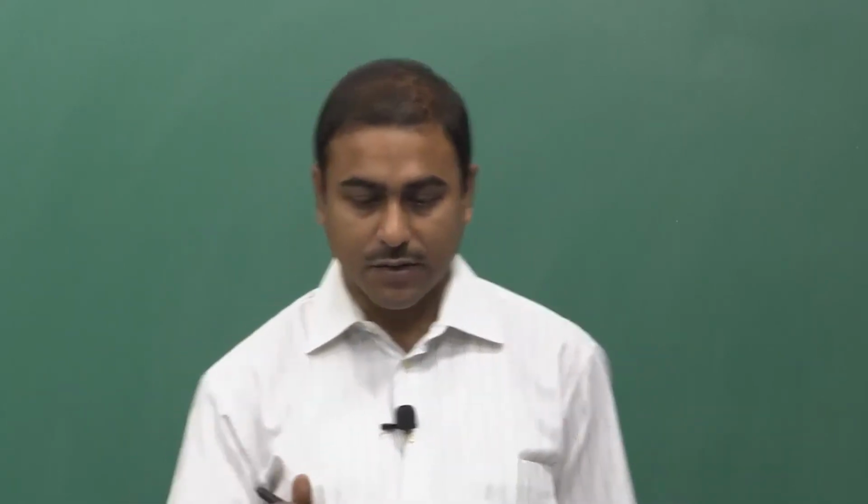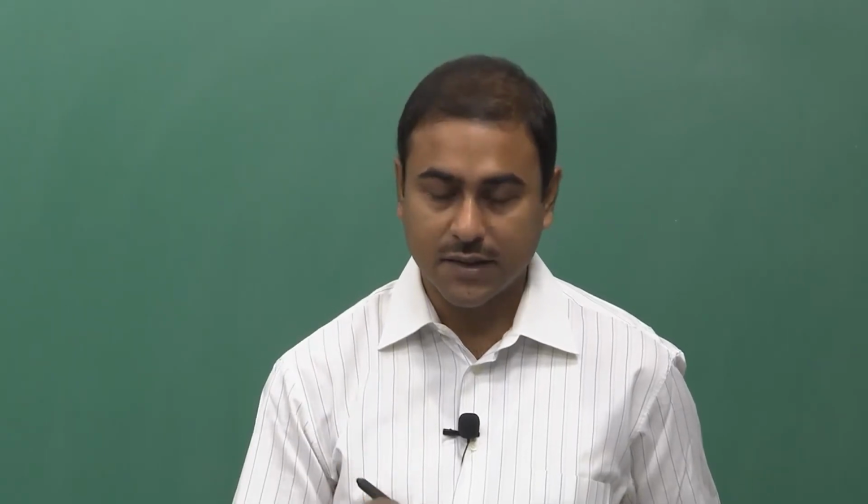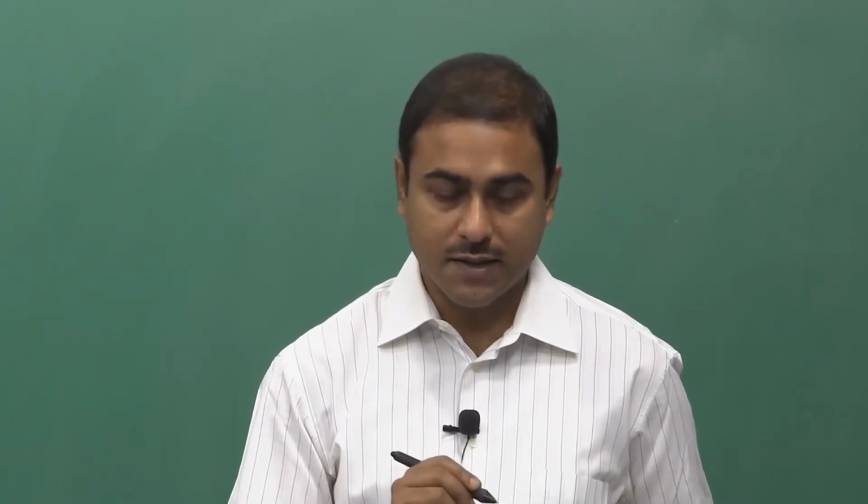So, that technique is the fluorescence upconversion technique, and to discuss this technique I need to discuss just a few things, otherwise I will not be able to discuss this technique. So, that thing is the polarization.